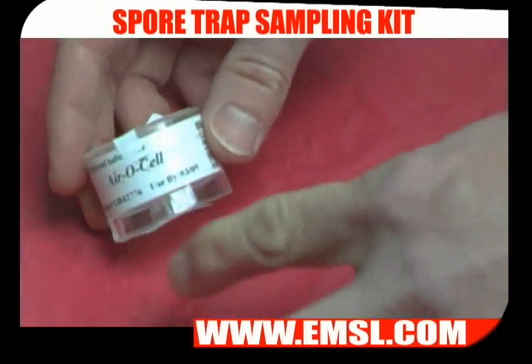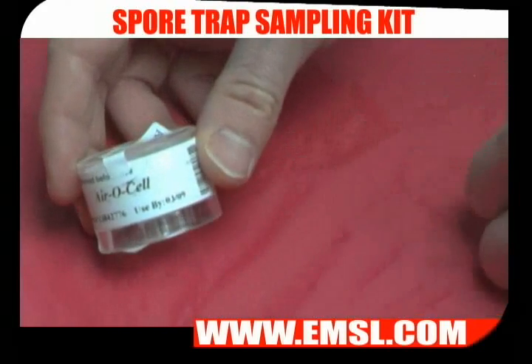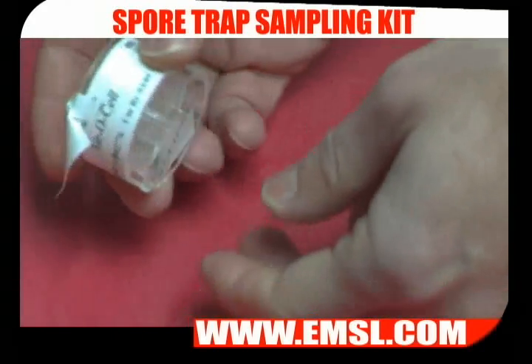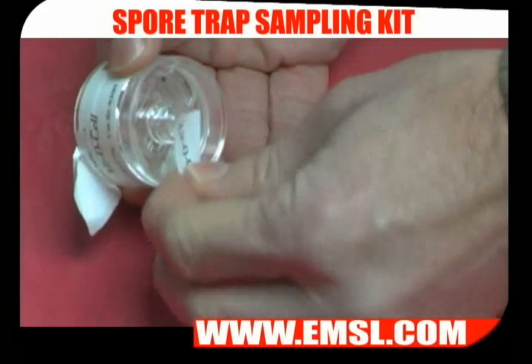Start by examining the cassette's use-by date and make sure it has not expired. Remove the sticky tabs and place them to the sides — you'll need to reuse these at the end of the sampling.